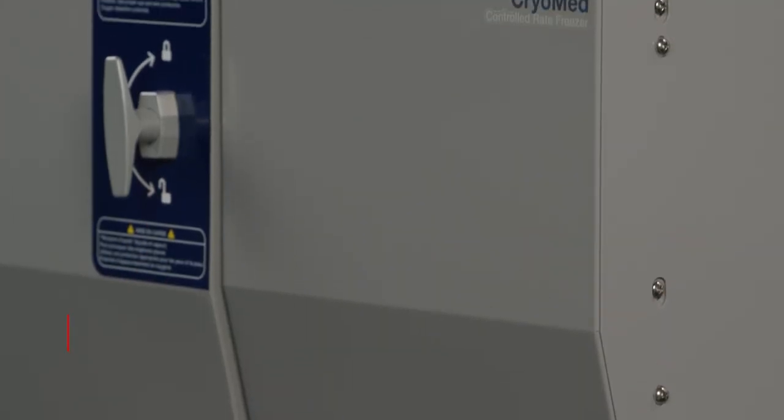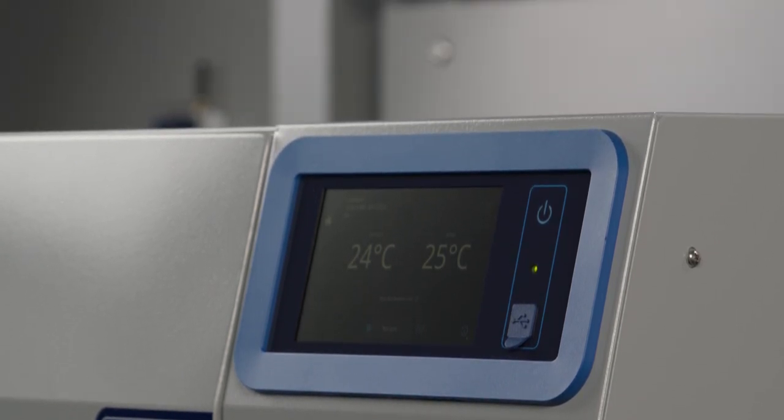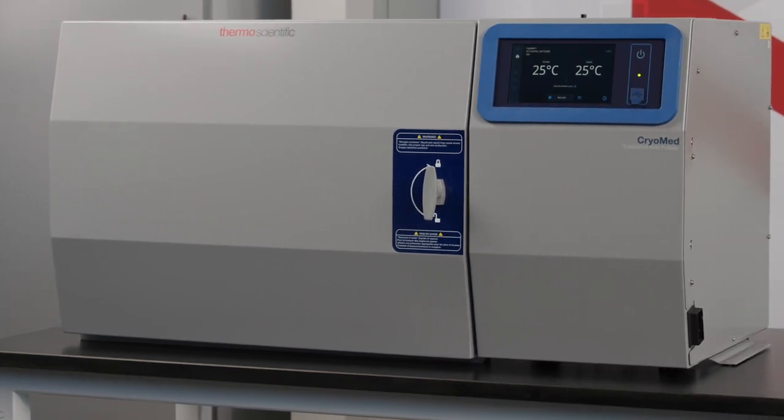Hello, my name is Chase Miles, Senior Global Product Manager of the LN2 cryopreservation portfolio at Thermo Fisher Scientific. Today we're going to talk about the initial installation of your new Cryomed controlled rate freezer.